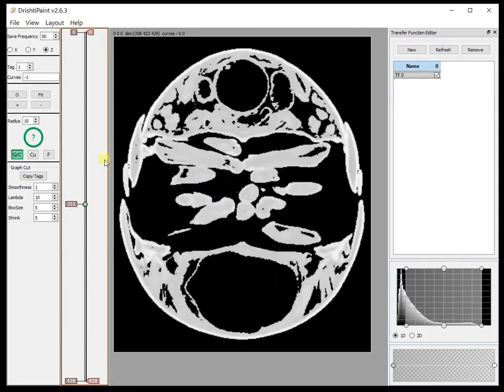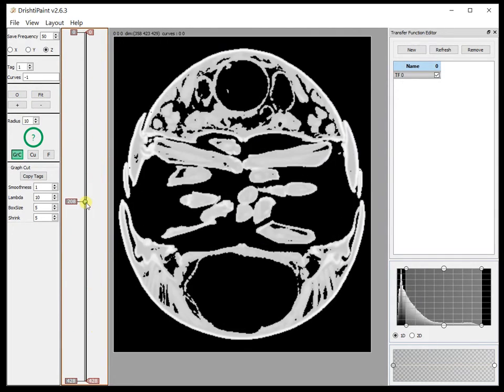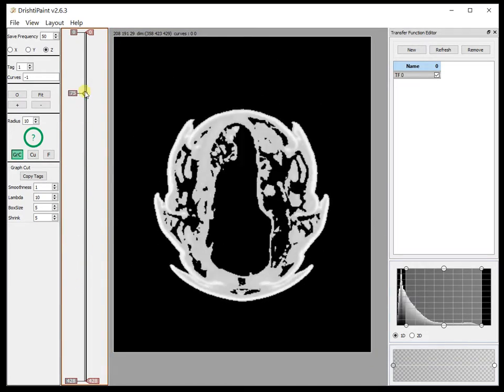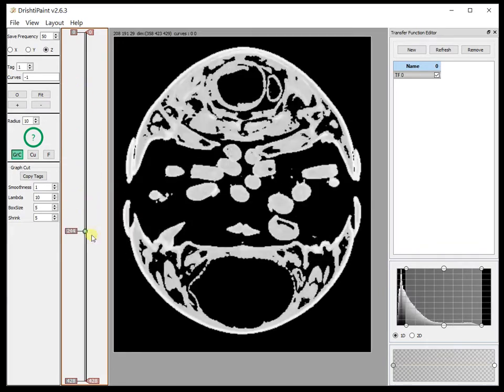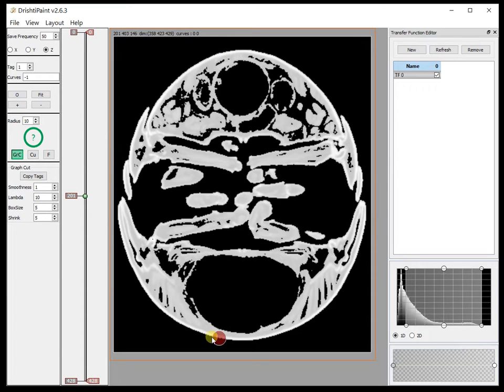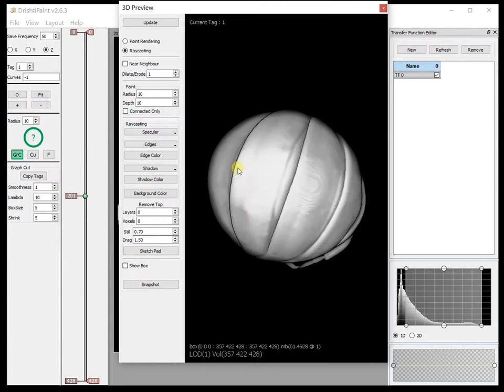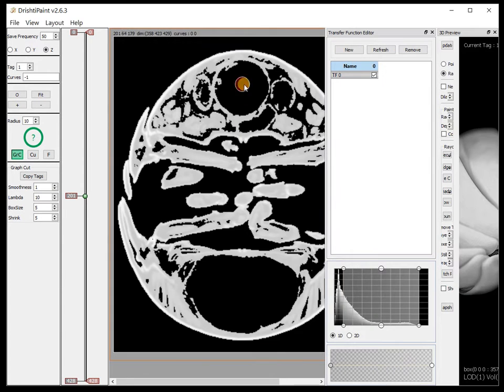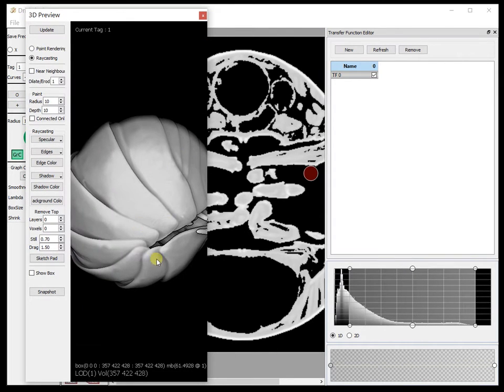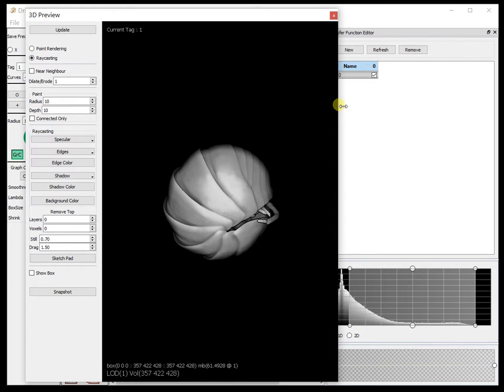that, this is the data. Now what I would like to do is tag this region here, which is the stomach of this woodlouse, and separate it out. In order to do that, we would have to shrink wrap this 3D volume and then extract this region here. So let's apply shrink wrap to this data.